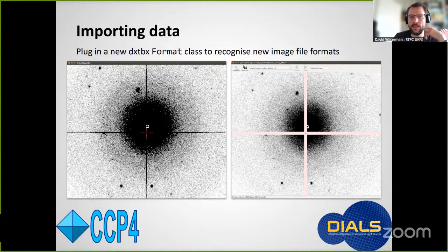And here's a MicroED example to illustrate what I mean. In this case, I was sent images that had been recorded on a TimePix detector with a really minimal binary format. A quirk of that particular detector is that there's a central cross of pixels between these four quadrants. And this cross is formed of pixels that are 3 times wider than a normal pixel.